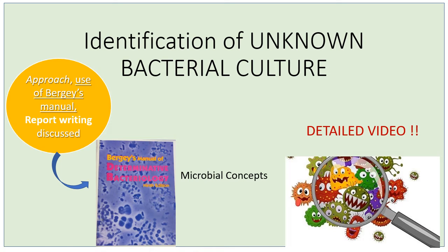So in this video, we are going to discuss the identification of unknown bacterial cultures. You are already introduced to Bergey's Manual of Determinative Bacteriology, say from your first year. That's what we use for identification. I'm going to discuss the steps for how to proceed with the identification of a given bacterial culture.